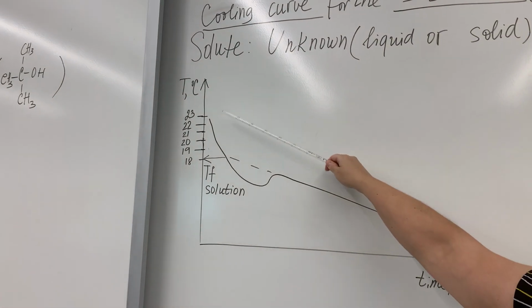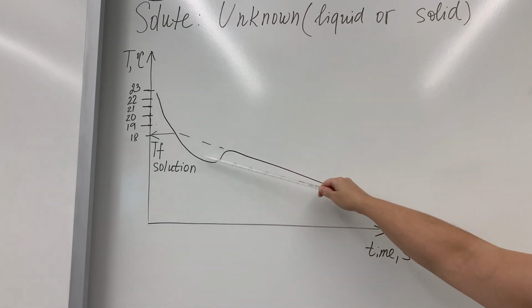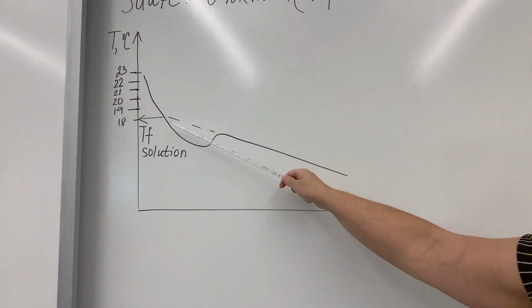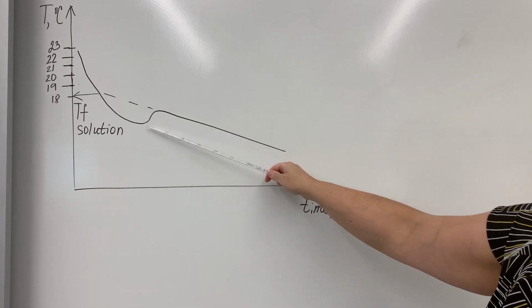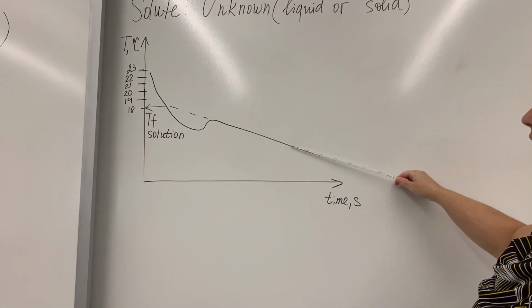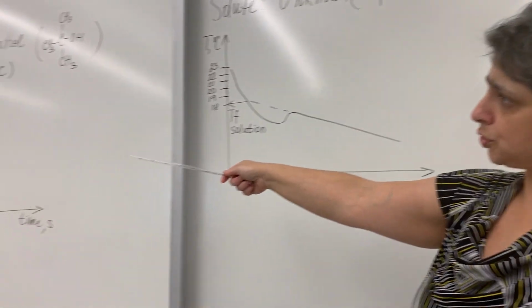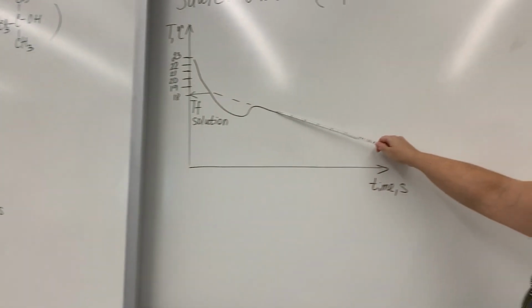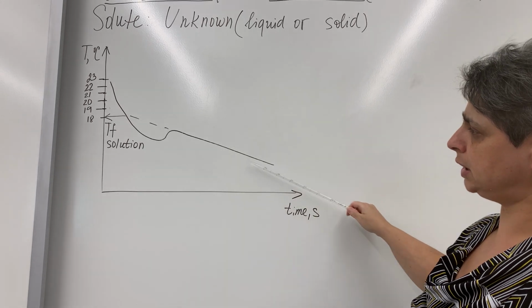And then you continue cooling. Most often you do see supercool. You may or may not see supercool, it's not that critical. But then what happens is, after briefly coming back, temperature slowly decreases. Unlike in the earlier curve that we saw for the pure solvent, here temperature never stays constant, it gradually decreases. There's clearly a little bit of a negative slope right here.